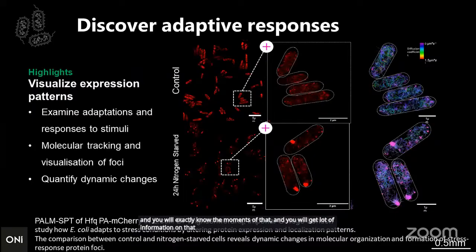This is a similar kind of study, but they have used PA-mCherry. Here it is a live cell, so they have used PA-mCherry to do the live cell tracking.